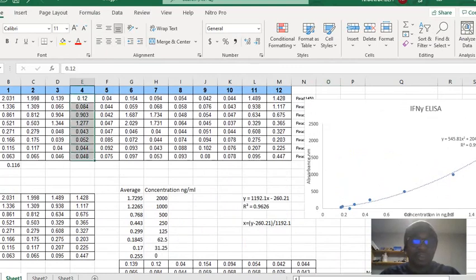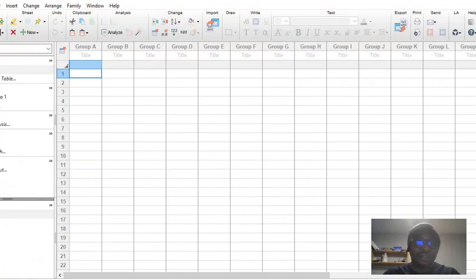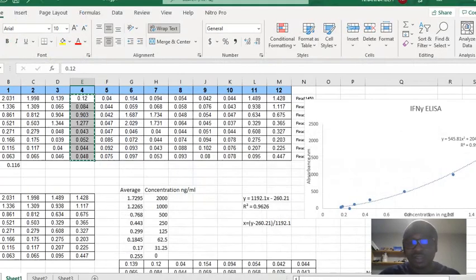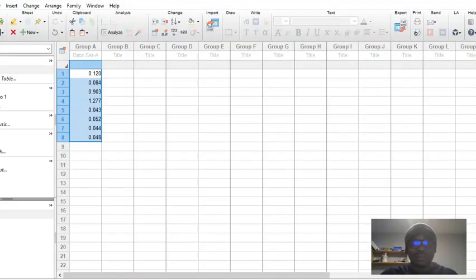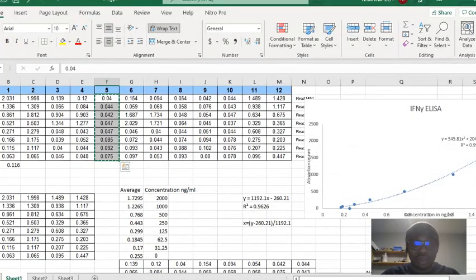At some other time, I'll also try to give you a lecture on how to run a straight line graph with Excel to determine the concentration of a solution, most especially when you are handling ELISA samples. What we have on my desktop now is actually ELISA samples, so that will be for another time. We would look at that. But today we just want to see if our data is evenly distributed or not, and if it's evenly distributed, what we have to do afterwards.